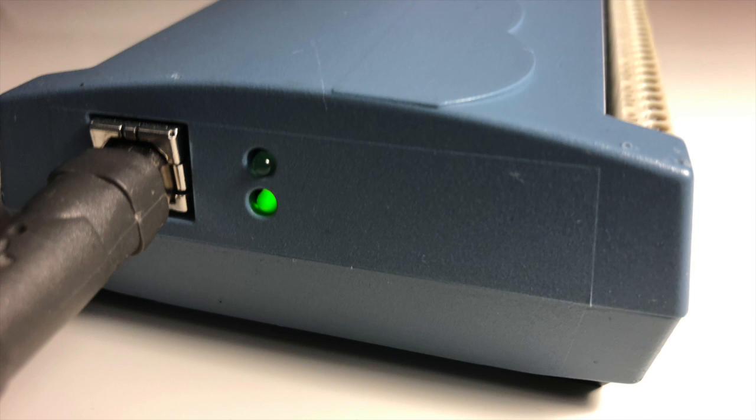You will notice that the power indicator light has come on, but the status indicator light will still be off because the communication between the two devices has not been established yet. You need to install and set up the external USB 3102 box on the analyzer.